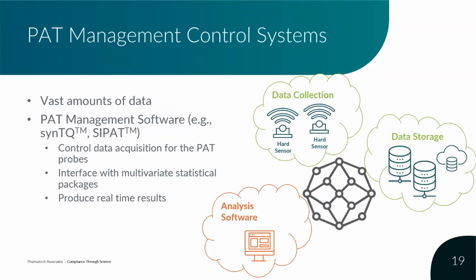When you're deciding on placement of process analytical probes, you need to make sure you've got some sort of a port nearby that you can actually remove a sample manually and confirm the result of the process analytical technology probe against, for instance, an HPLC method or maybe a UV method. But the placement of those probes is a very important aspect that you really need to consider.